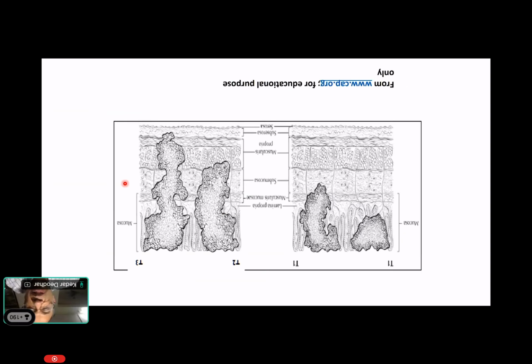That's why we look at a specimen which is post chemotherapy to us. So this is pT1, mucosa and submucosa. pT2, involvement of the muscularis propria. pT3 is subserosa, and we have pT4, which is serosal involvement. So by and large, what we are seeing in the last 7 to 10 years is that except for pT1 or very early gastric cancers, most gastric cancers will receive perioperative or preoperative chemotherapy and then will come on the cutting table.